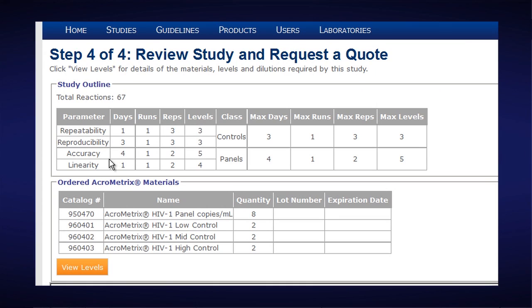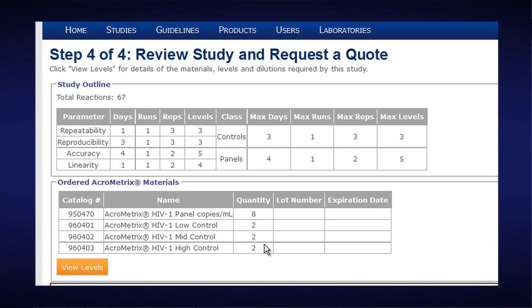We'll run repeatability, reproducibility, accuracy and linearity studies. It's telling us that we need eight of the acrometrics HIV panels and two boxes of the low control, mid control and high control.